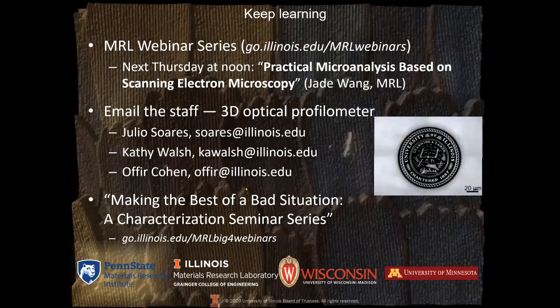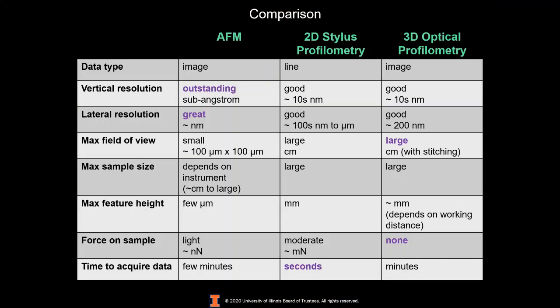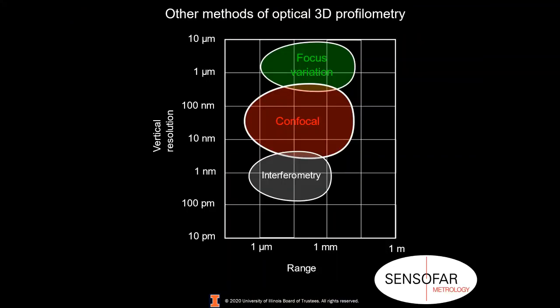If you look at this slide, you can see that if you want a resolution that really goes down beyond 1 nanometer, or below 1 nanometer, then you're better using interferometry. If you have samples that are too rough, this will not work, so then you're restricted to the other two. And if you have two dissimilar materials on your sample, it's tricky to do with interferometry as well. It's not impossible, but it makes your task much more difficult.